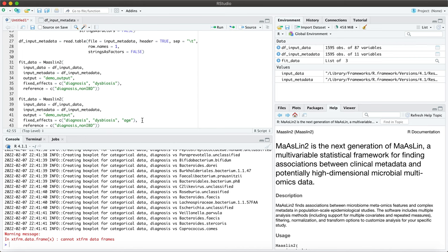If you recall, by default this package uses LM. We could do CPLM for example, for compound Poisson linear models. Now with these statistical models, just make sure that if your input is count data then you can use a negative binomial distribution or a zero-inflated negative binomial distribution. Whereas for non-count inputs you can use the LM or the CPLM.